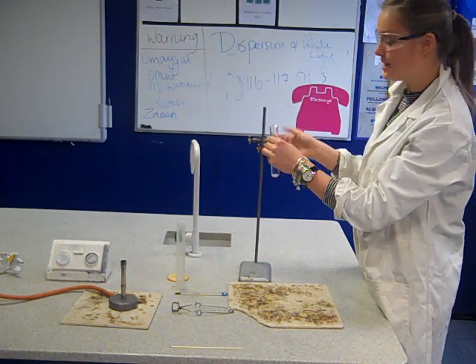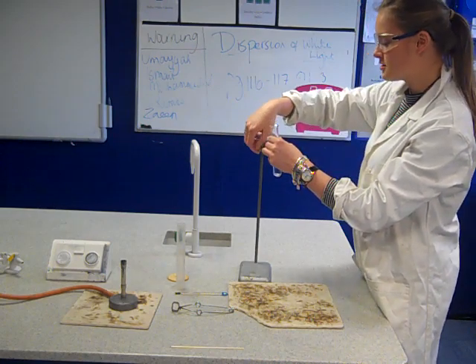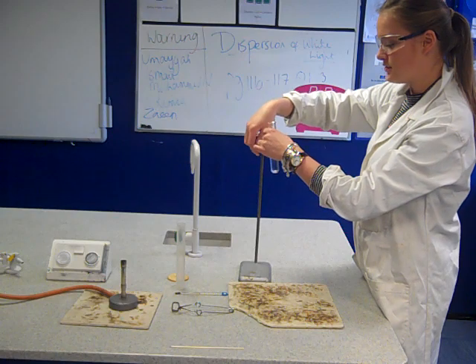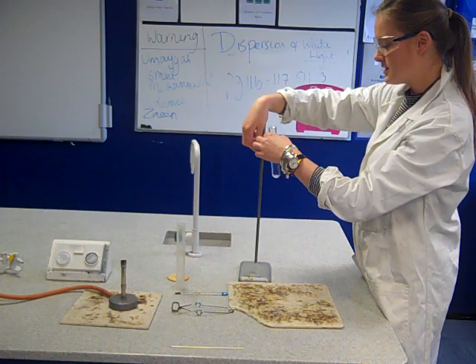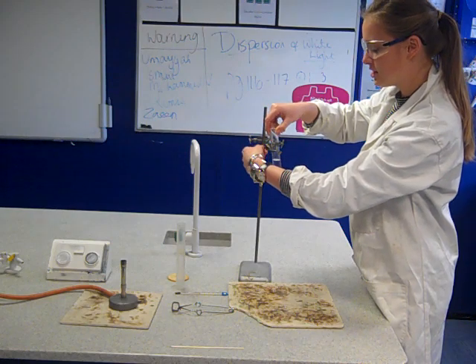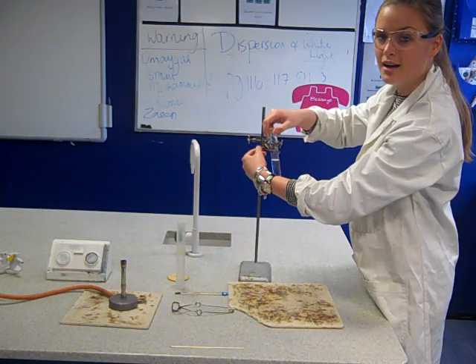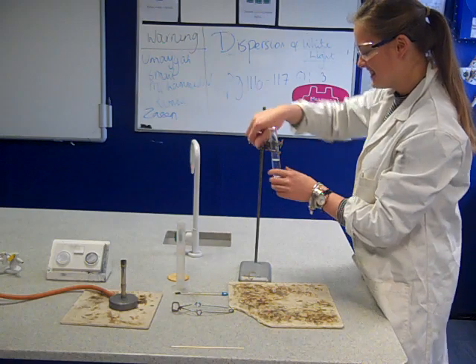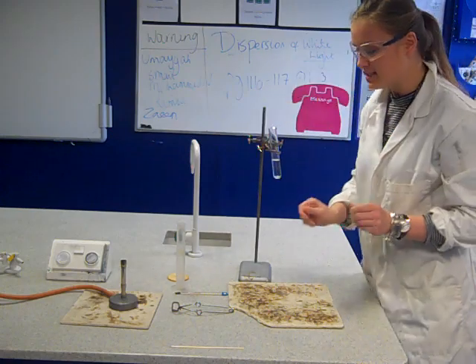So again, just like we did before when we're setting up the stand, we need to unscrew our clamp so it's large enough to fit our boiling tube in and tighten it again. Careful not to do it really, really tight so we're not smashing the glass, but it needs to be secure in there. Okay, so now our equipment's set up.